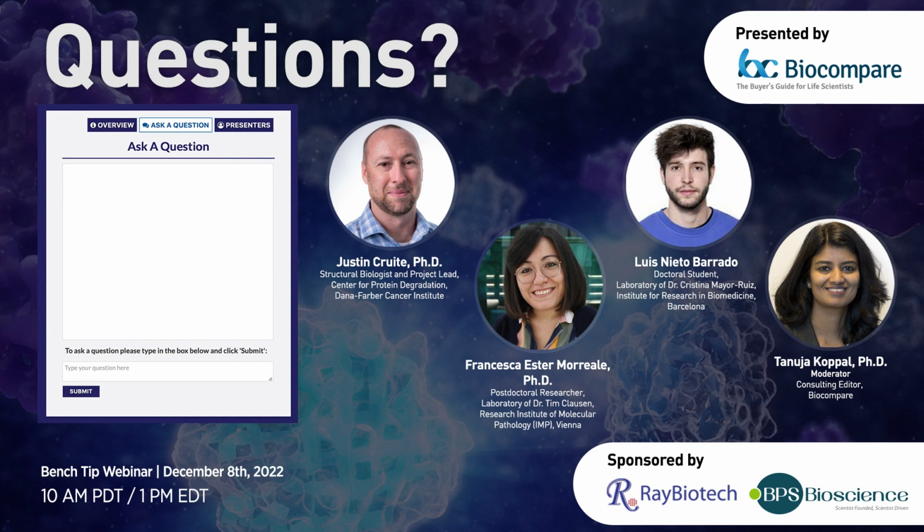I just wanted to add that in the end, the ideal thing would be to choose several techniques with different readouts to prove the same thing, to use orthogonal studies. For example, if you want to test interaction studies, you can do it inside cells. As Justin said, you can do BRET, you can do NanoBiT, but you can also do it in lysate, doing pull-down assays or biotinylation assays.